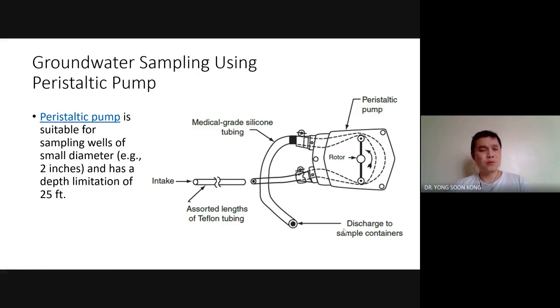But this one actually has a limitation. Now, if you learn physics, if you want to draw moisture, the deeper the tube well, the harder it will be to draw. Because why? Imagine this silicone tube. If you have a silicone tube and you're sucking on this tube, at a certain point, if this tube is too long, you will have a very tough time trying to remove this liquid over a long distance inside this tube.